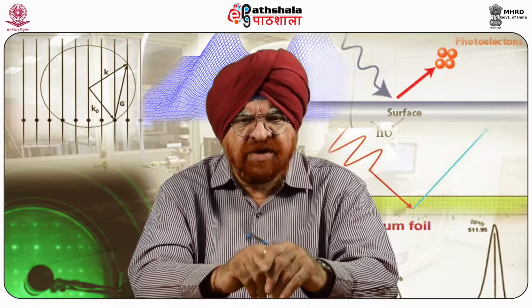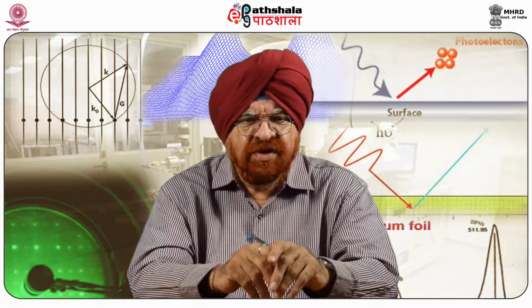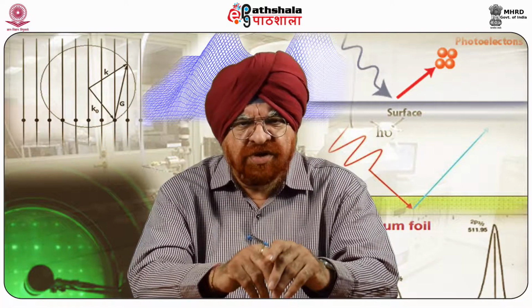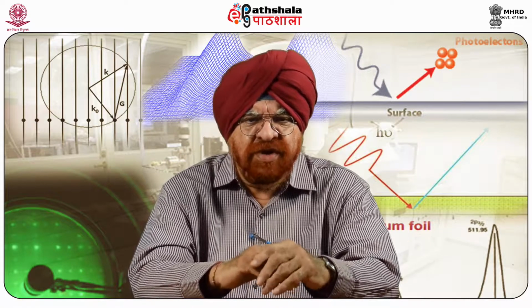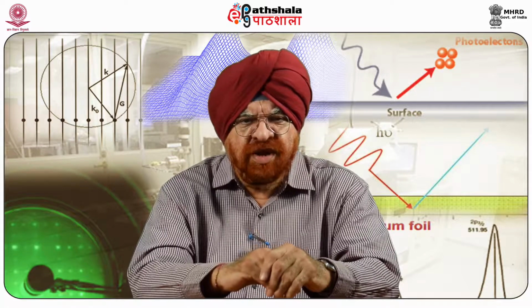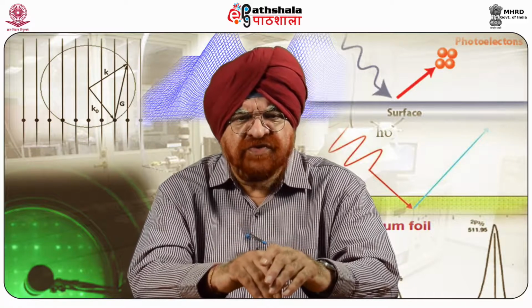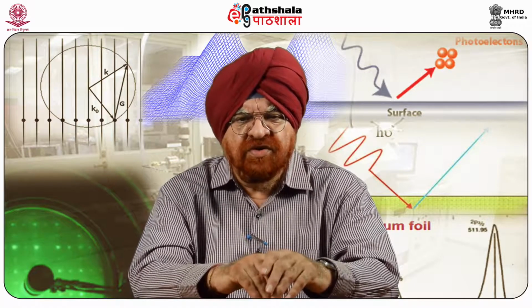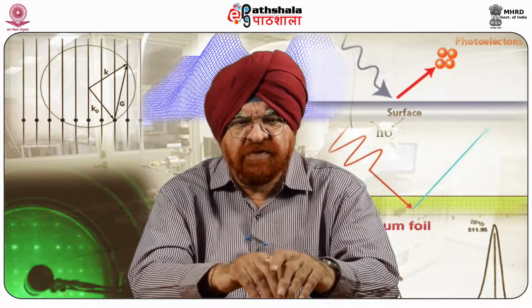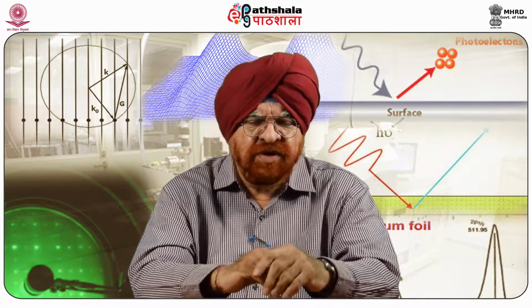Detectable magnetic field intensity, H, is in the range of 10 amperes per meter, detectable magnetic field B is in the range of 0.1 Gauss, and measured forces are as low as 10 to the power minus 14 N with a spatial resolution as low as 20 nm. MFM can be combined with other scanning methods like SCM if required.